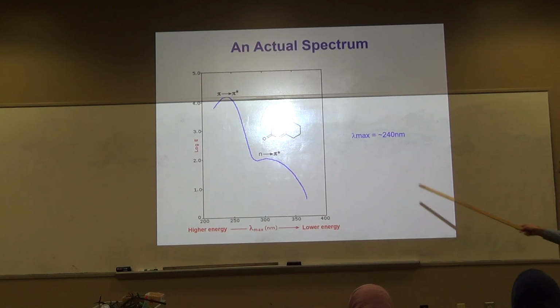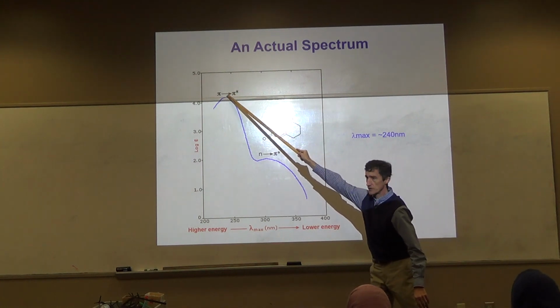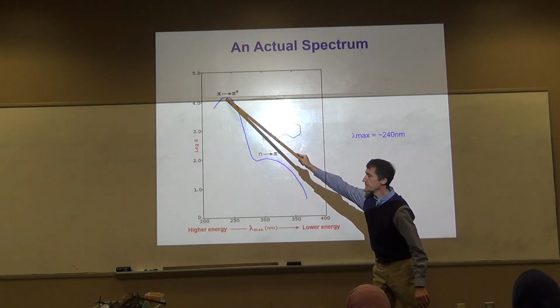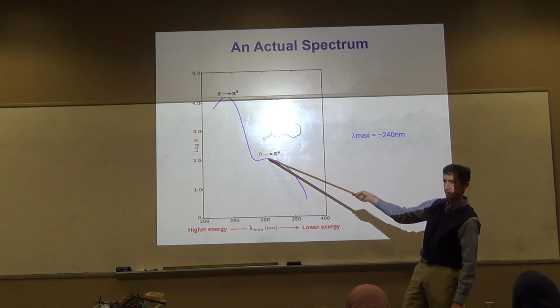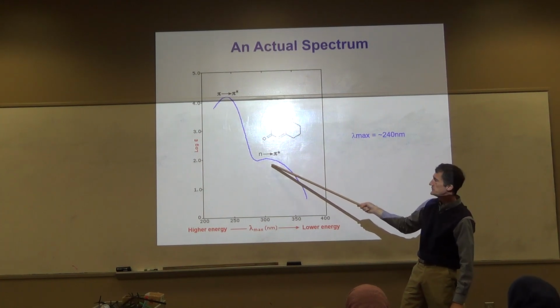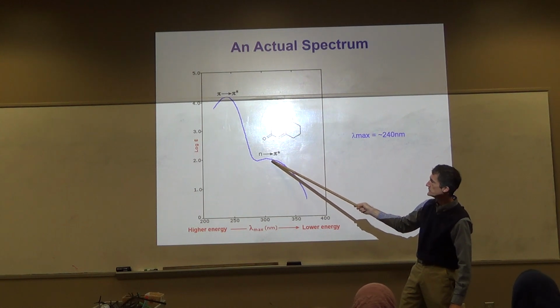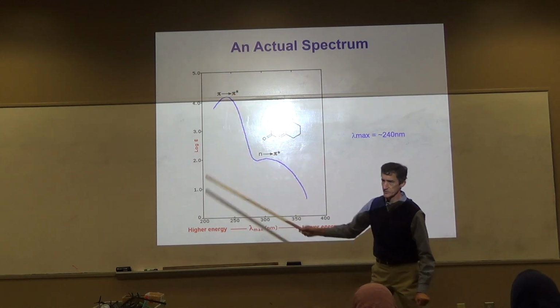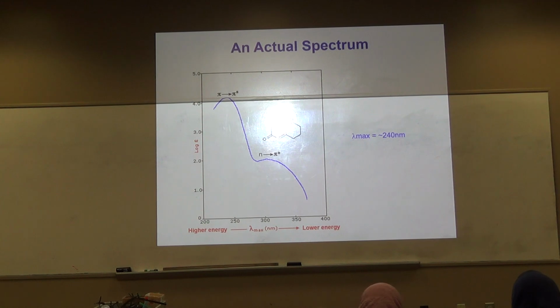Where is lambda max at? 240? Pi to pi star. It's usually most intense. Look here. Yes, it's more to the right. As you correctly said, non-bonding electrons are more to the right, and lower energy is needed to excite them. But it's usually not the lambda max. So the maximum absorbance usually comes from pi to pi star, and usually because of that, we focus on talking about pi transitions, because it's the maximum absorbance.